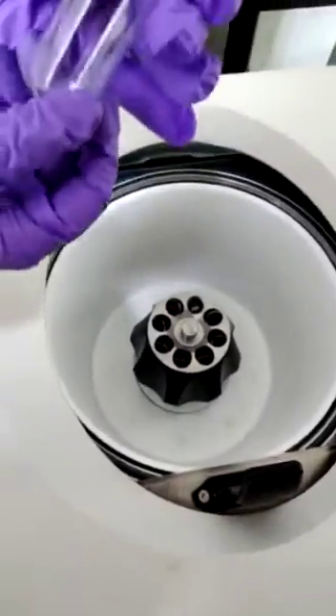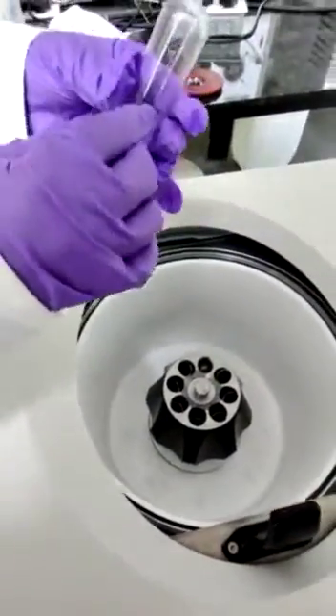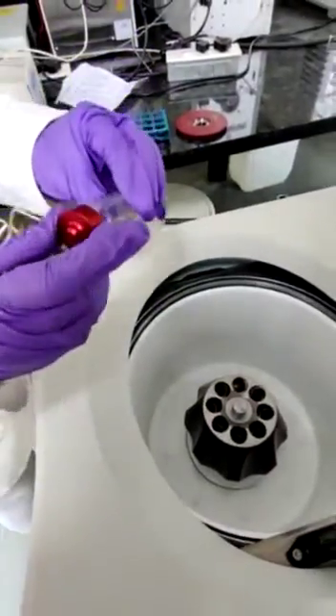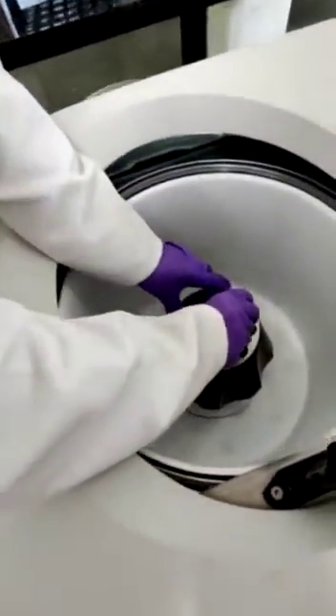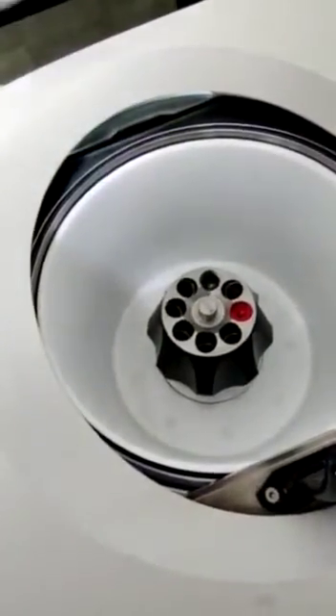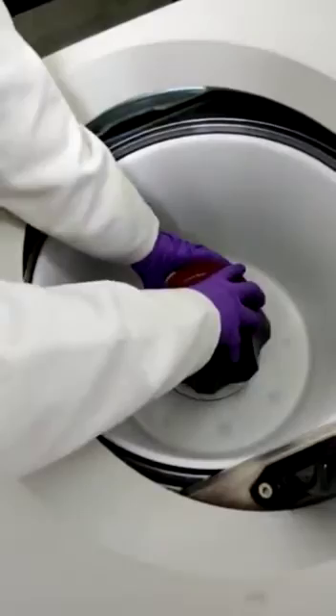You can see these tubes wherein we place the sample, seal it, and then close it with the help of these lids before placing it inside the rotor. Similarly, a balance is also placed, and then the rotor is closed with the help of these lids.